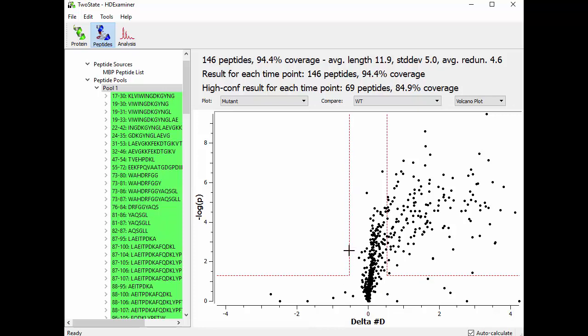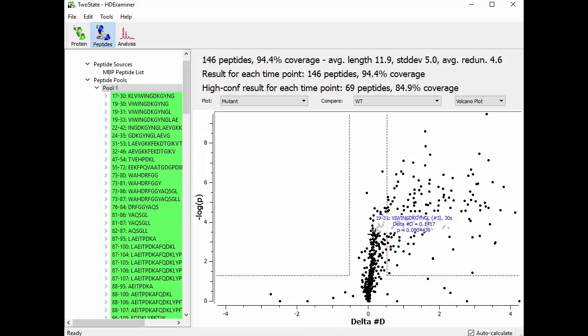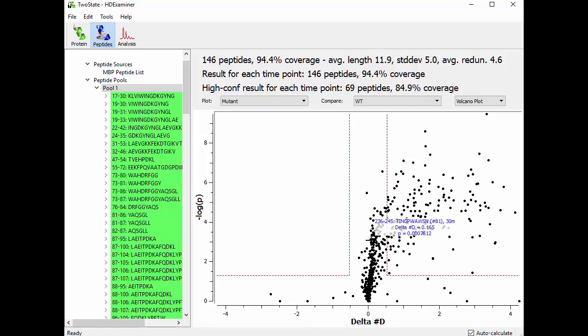the replicate variance across all of your data. So what this means is that at a delta number D of about it looks like about plus or minus 0.5 or thereabouts, we are still within the replicate noise and therefore we can't be super sure about the statistical significance of these points in the middle here.